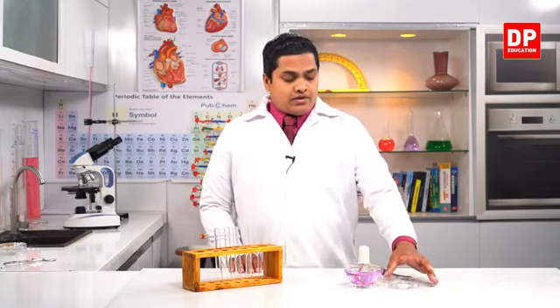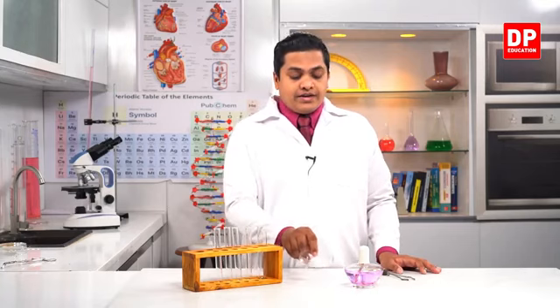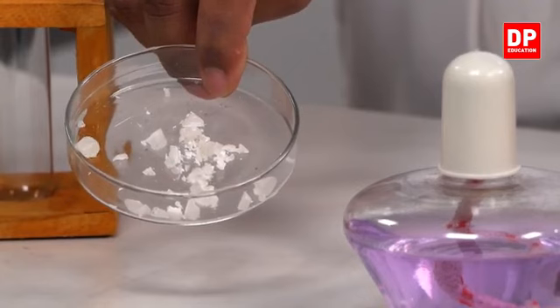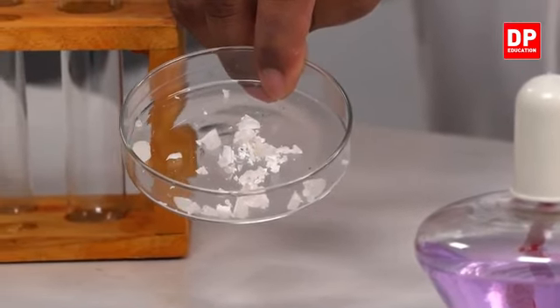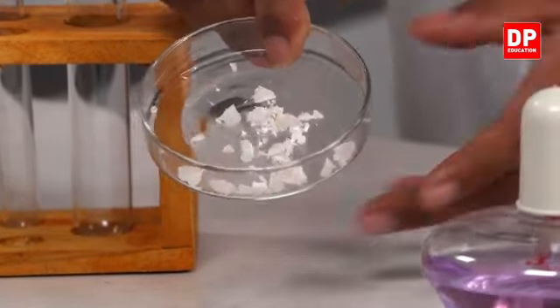We'll observe what kind of physical change is going to occur when I heat these pieces of wax. This is solid wax. You can observe very clearly the solid pieces of wax.